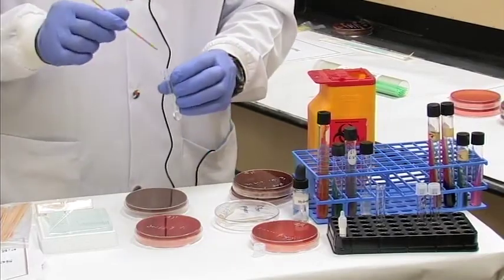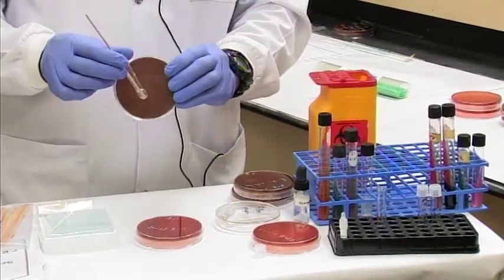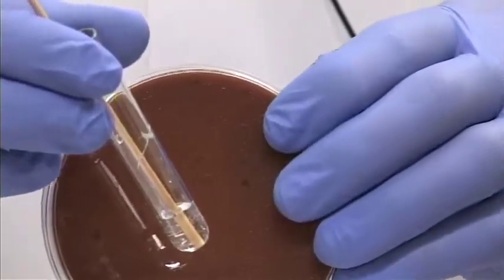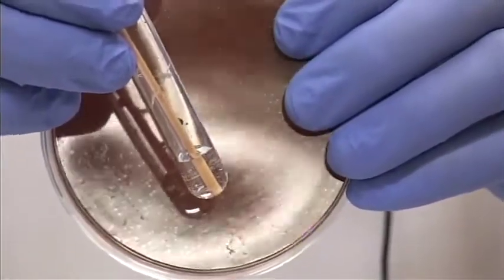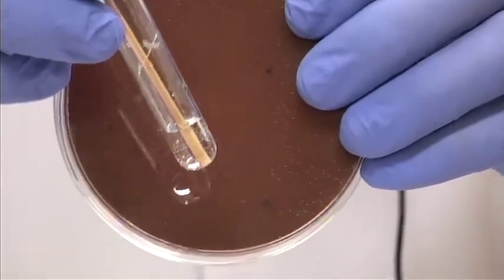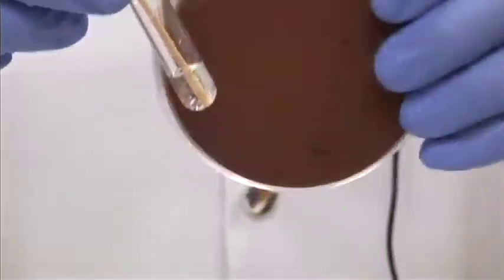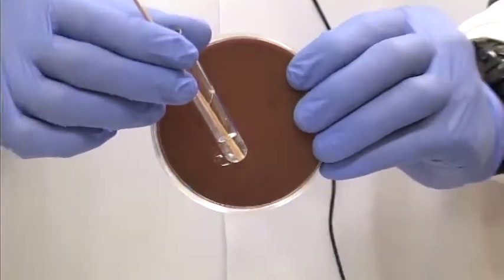So now I'm going to immerse my bacteria into my tube, hydrogen peroxide, and we look for a reaction. In this case, you see no reaction, no bubbles being produced because the bacteria here is Streptococcus, which does not possess the enzyme catalase, and thus you have no bubbles being produced. Again, the background I've used here is just to show you the tube and the hydrogen peroxide.